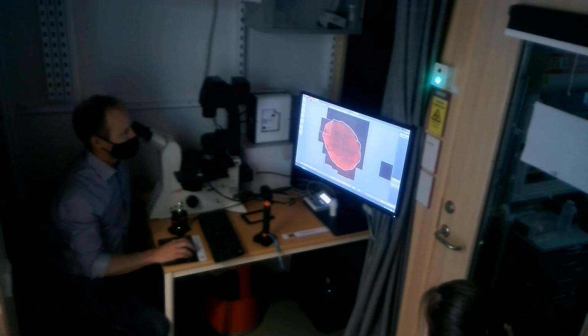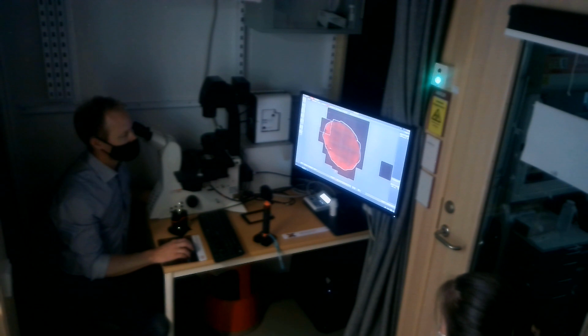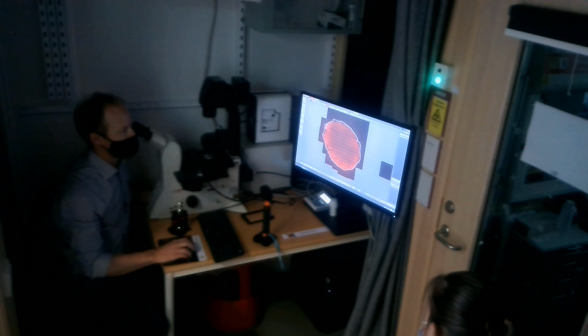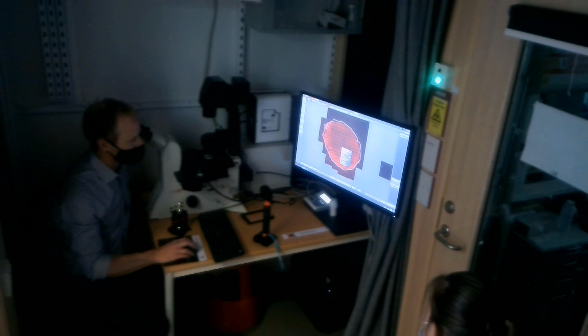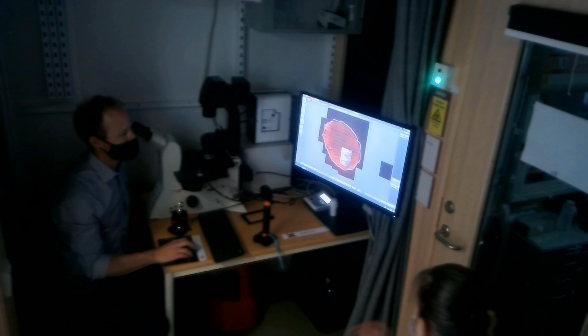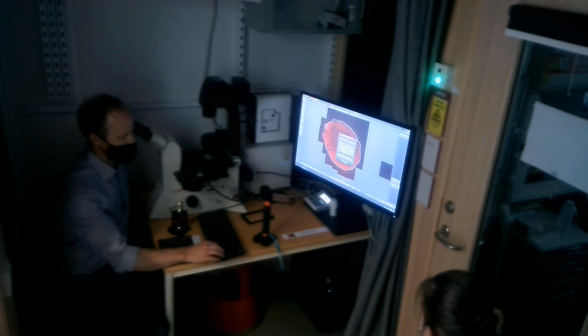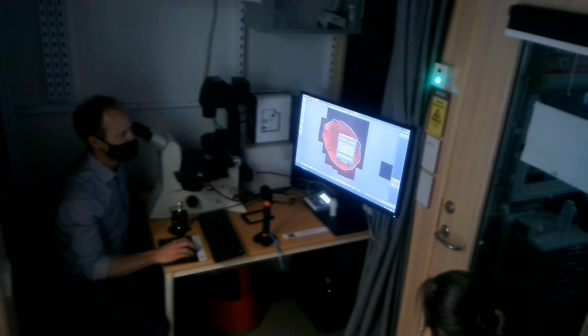Okay? So I picked out the whole tissue, but I want to image this maybe with the 20x, but I don't need this whole thing. So now I can right click in here and I can set up regions in shape. If I click on that one, I'm getting the same that we had in our multi-well plate and so on. So now I can say positions. Within this I want to take, let's say, 20 random positions in this tissue.